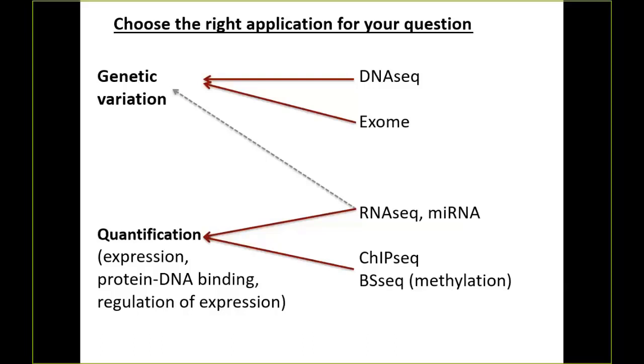Now in theory this should work, because I mentioned exome sequencing for genetic variation, and you expect to find exonic sequence in RNA-seq. In reality, this method actually doesn't work nearly as well as one would think. It encounters two major problems. The first major problem is that a lot of variant detection programs don't handle splice sites very well.